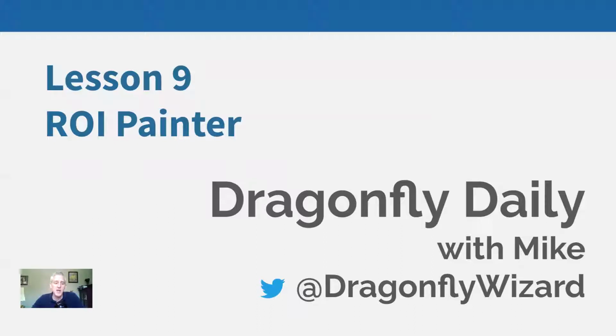This is the second of a three-part series, lessons 8, 9, and 10, that are specifically dedicated to image segmentation in Dragonfly. Yesterday in lesson 8, we looked at the ROI tools for creating ROIs. We looked at some thresholding and some other operations.